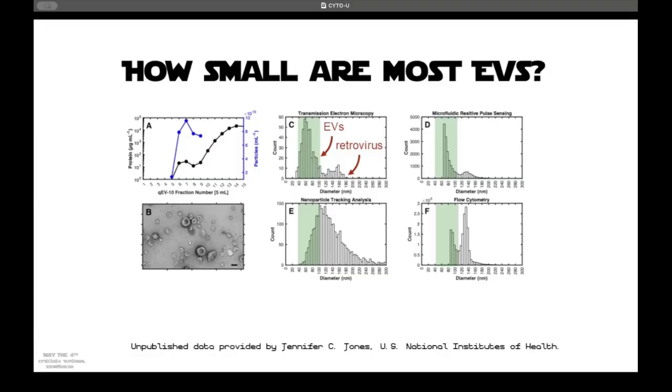One of the issues here with nanoparticle tracking analysis is the lack of precision in its diameter distribution. And this is why you commonly get a single distribution curve that's log normal. And it's kind of a smear from around 100 nanometers, which tends to be its limit of detection. This just really highlights why precision is needed in our measurements and how we can get different diameter distributions from the same techniques.